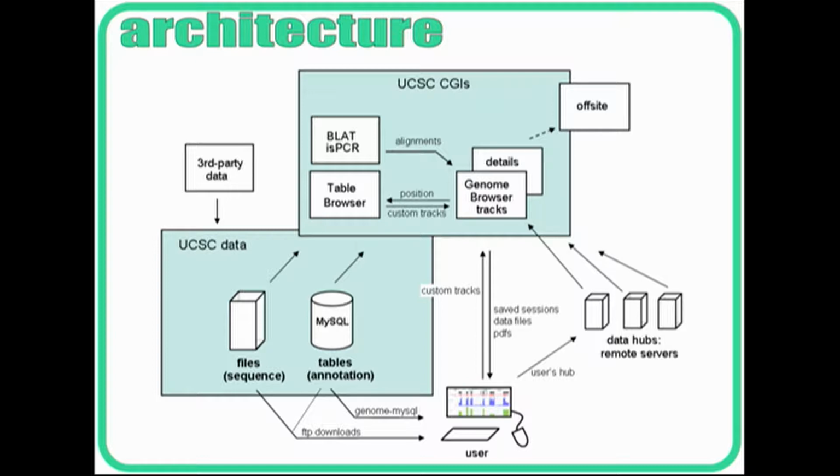So everything's condensed, and it's already pre-aligned, and so you can get to the answer really quickly. We can draw a picture with 100 RNAs in a couple of seconds, and you can see all of the RNAs on a big chunk of the genome very quickly. So we're optimized for speed, and the whole code runs in the C programming language, which gives us really good access to memory management and high-speed compute.